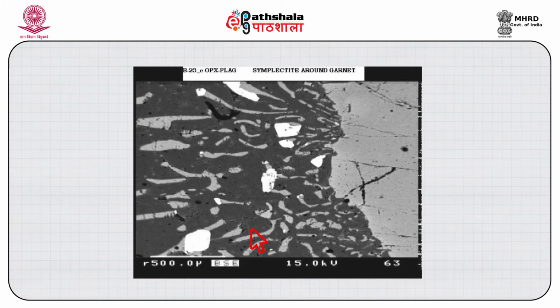Other than the plagioclase and orthopyroxene being produced as worm-like structures in this figure, one can also notice the iron oxides which are present in between, which were possibly produced as excess iron when garnet broke down, because it appears to be a high iron garnet. So, the SEM, that is the backscattered electron image, allows us to distinguish the breakdown reaction very nicely, and also allows us to chemically characterize the products which are being formed.